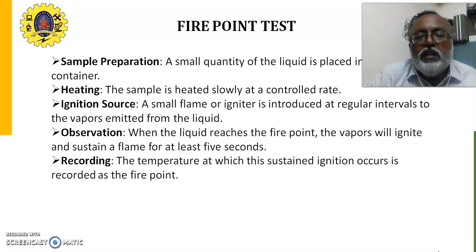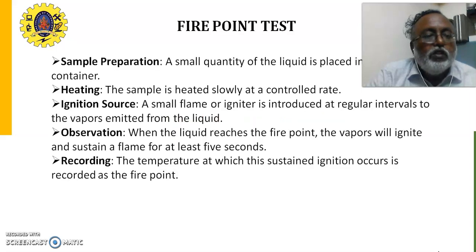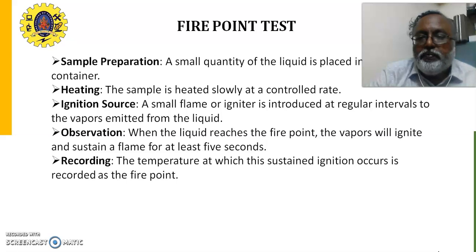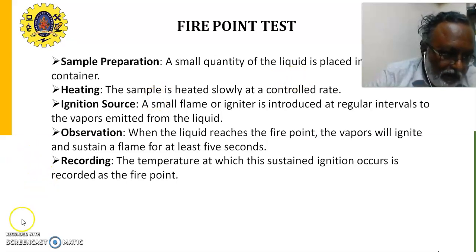The temperature at which this sustained ignition occurs is recorded as the fire point. So in the fire point test, we have to prepare the sample, then heat it, then apply the ignition source, then observe and record the reading. Thus, we discussed the fire point as well as the flash point.